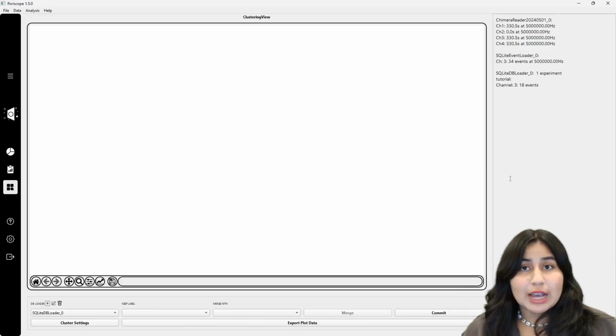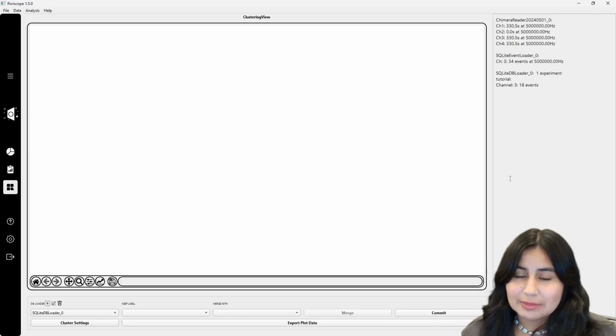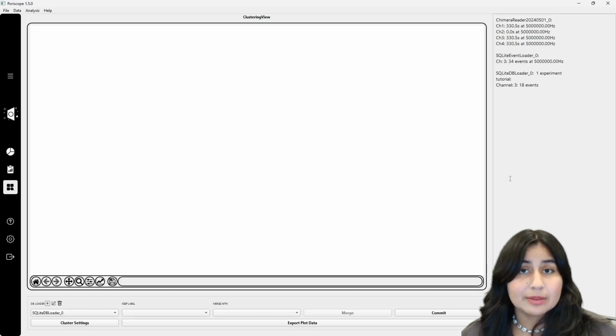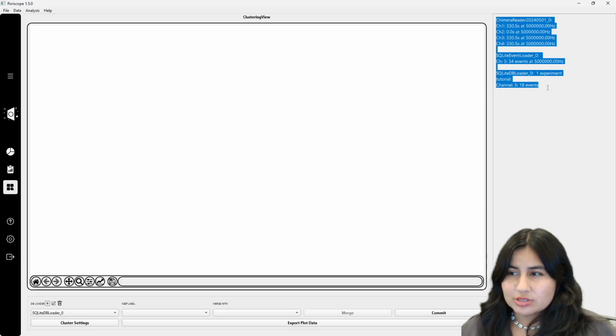This is a good time to remind you that when you load a session, you are not actually loading the actions. So this session hasn't run the event finder, this session hasn't run the event fitter or written the events found. That's why you can see here in the log panel, you won't see found events or wrote events. You are only seeing the milestones.